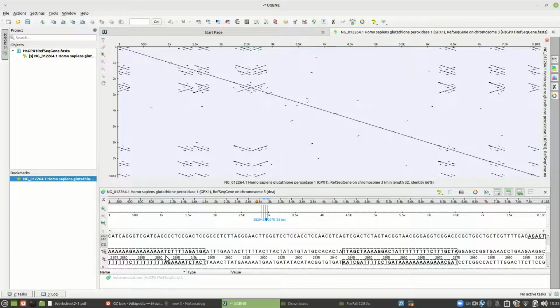The easiest ones are going to be when they're long sequences like this that combined with it. And actually this looks, it probably isn't. I will investigate it, but that's why it showed up here, because there are some A's and some T's, and we're getting this line going like this, and it's going there because we had some A's and T's next to each other here, and we looked for the inverse complement here.